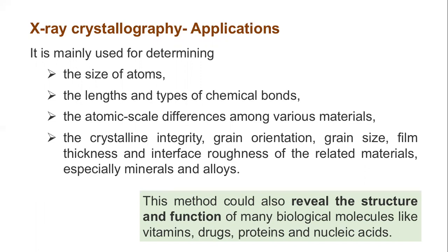These become very important. In biology, X-ray crystallography will reveal the structure and thereby the function of many of the biomolecules like the vitamins, the drugs, the proteins, and the nucleic acids. So this has become a very important tool as far as protein structure and function study is concerned, that is, in the field of proteomics.